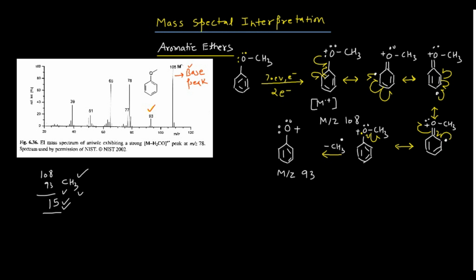If I want to give a name to this particular one, then this is where I can write even electron phenolic ion. And again, see, this species is also resonance stabilized, right? But it is not that stabilized compared to the molecular ion. So its intensity obviously is a little bit lower. And if you want, you can draw the resonance structure of this as well by using the same guide which I have explained for the molecular ion. But I am not drawing the resonance structure for this even electron phenolic ion.